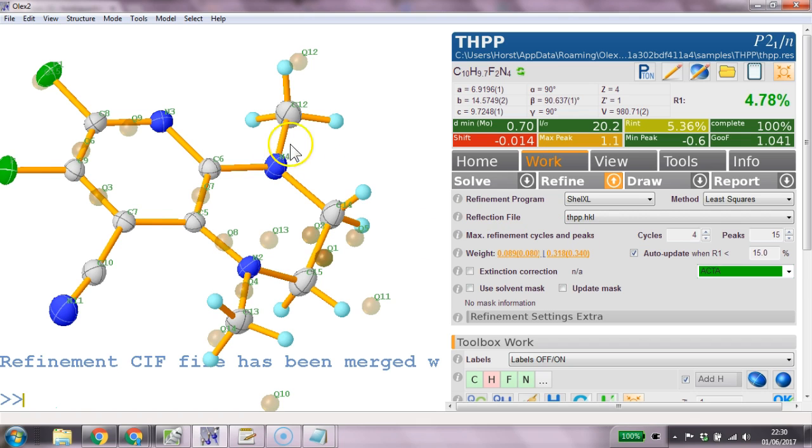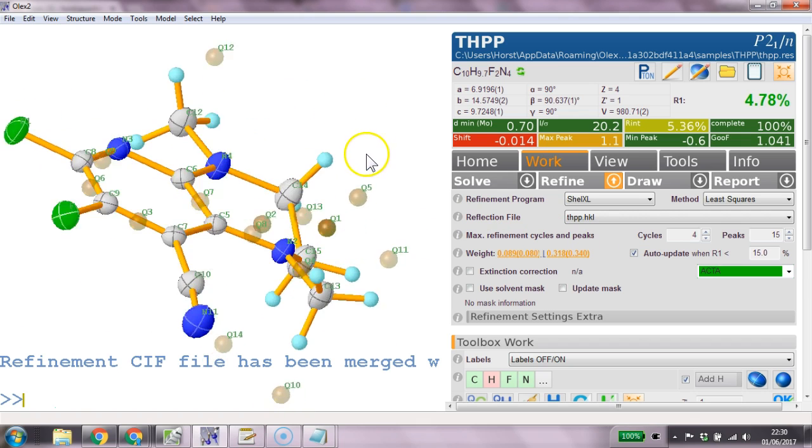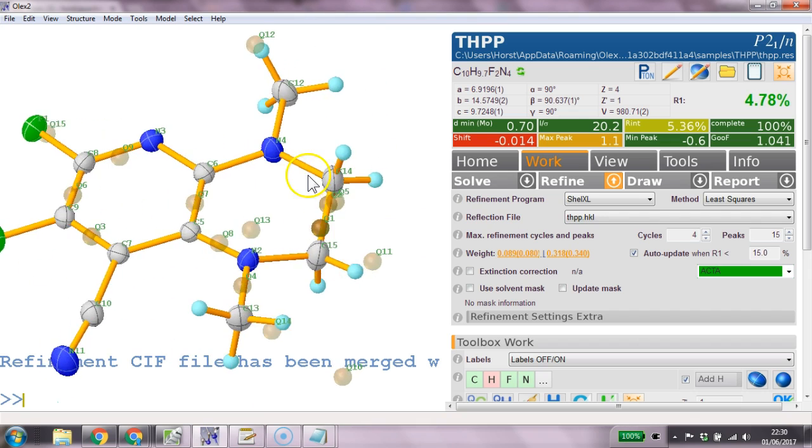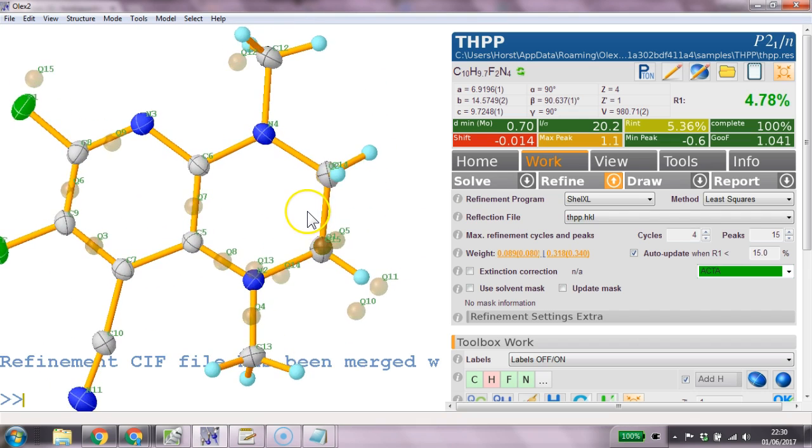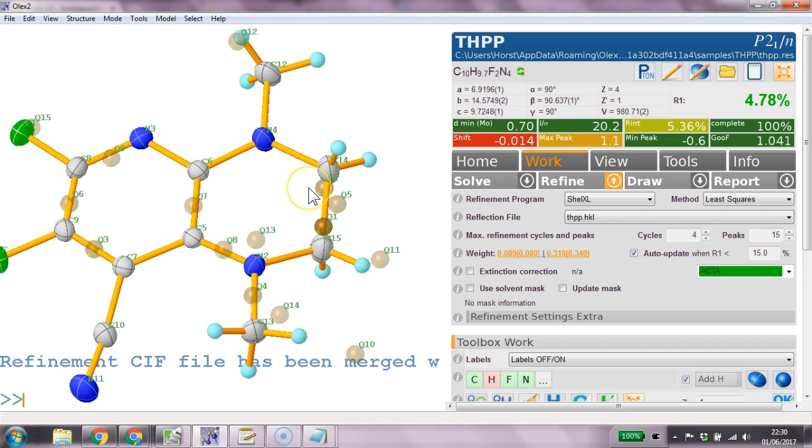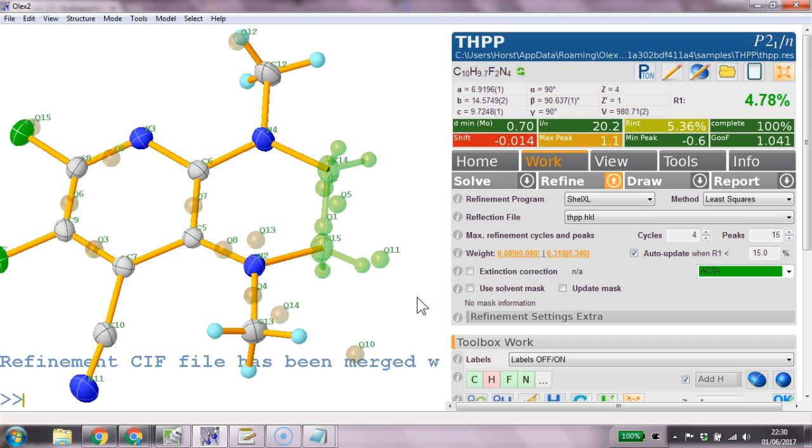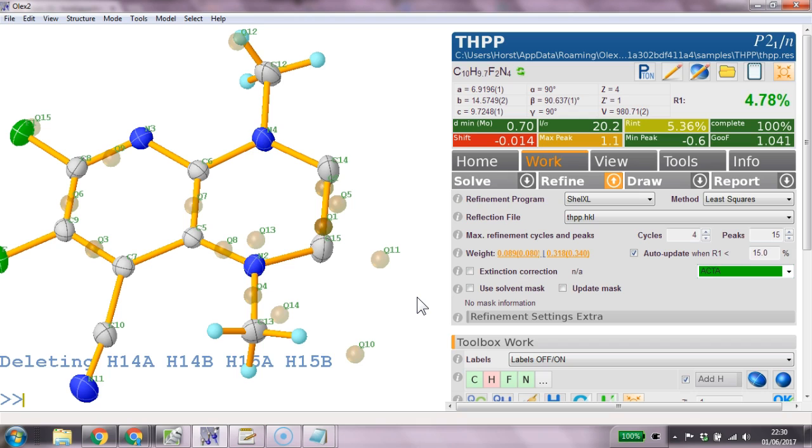So this is a disordered structure so we need to do a little bit of disordered work. And I will just show you we need the mouse for making some selections I suspect so I'm going shift in the left mouse. I'm going to select these items and go kill $H and it deletes all the hydrogens in this part we want to model as disordered.